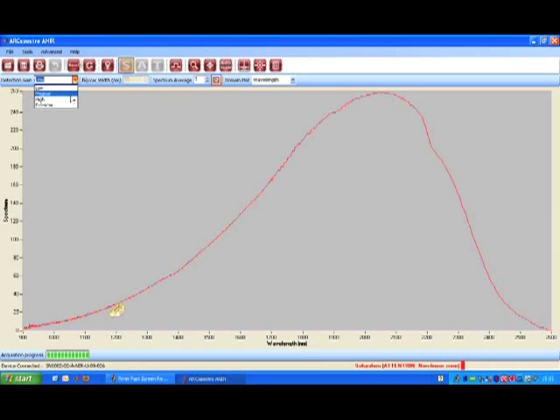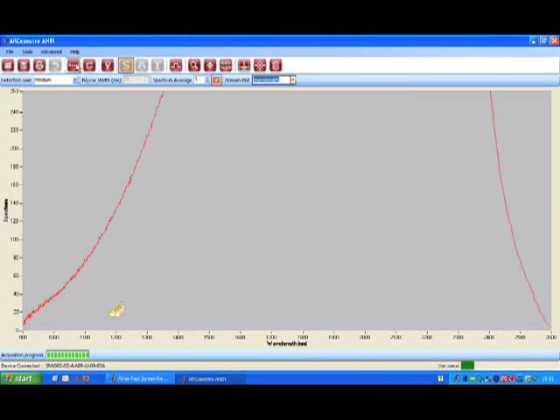Set the detection gain to medium and take another measurement. Press the auto-scale button.